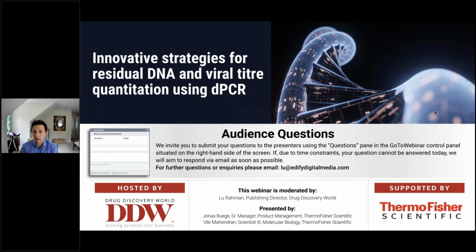Secondly, it's targeting chromosomes across the entire human genome, which makes it specific to human cell lines, not only specific to HEK293. If we only went after something specific to HEK293, we would not get to the sensitivity that is really required. So that's why the assay is specific to human and not just to HEK.